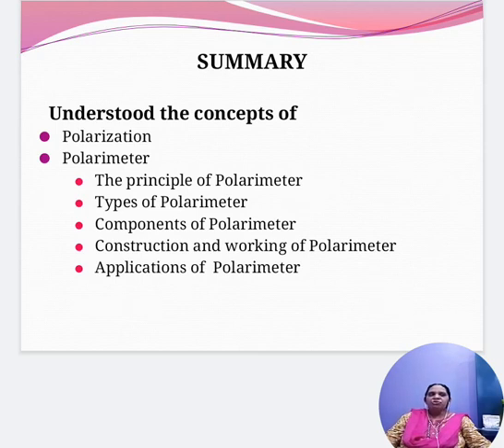The polarimeter tube holds the optically active material. It is made up of this sample tube. It must be clean. It must be free from strains to avoid circular polarization.